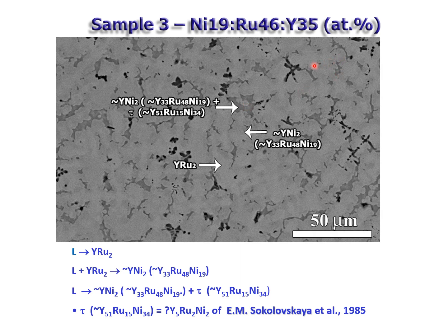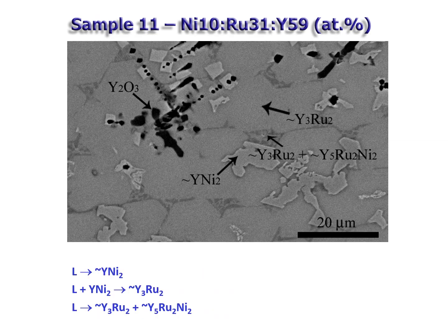Now this is made more complicated because you've got oxides here as well, which is a pain, so you just ignore them. What happens is that yttrium is very reactive and loves forming oxides, so you normally ignore the oxide phase, and you'll notice normally the dendrite forms on the oxide phase, because it's easier to form. It's easier to form on something than it is to form in the liquid. It's like it's easier to make money if you've got some money to start off with. So here's the same sort of thing again. We got this, and you can see it's faceted.